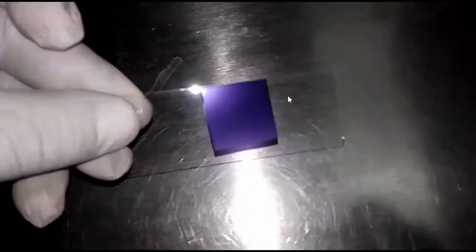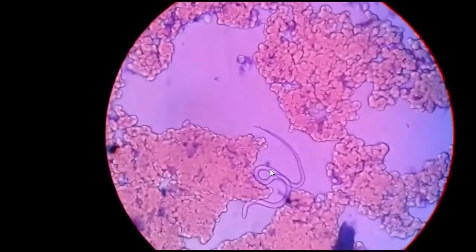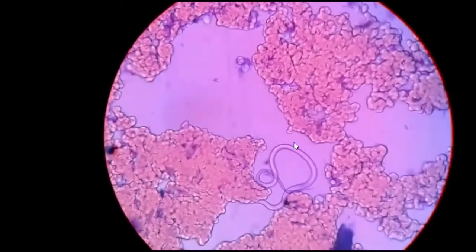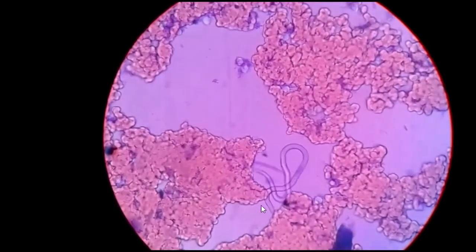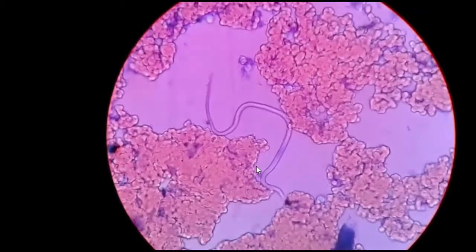So let's go with this slide. Oh my god, here you can see. This one is the live microfilaria. Isn't it? Here you can see movement.